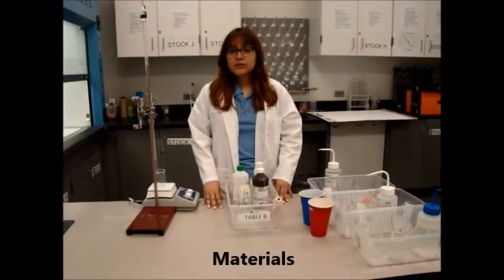Good morning and welcome to your 2017 spring practical exam. This exam is worth 35% of your semester grade. This first video is designed to present to you the materials that you will be using.